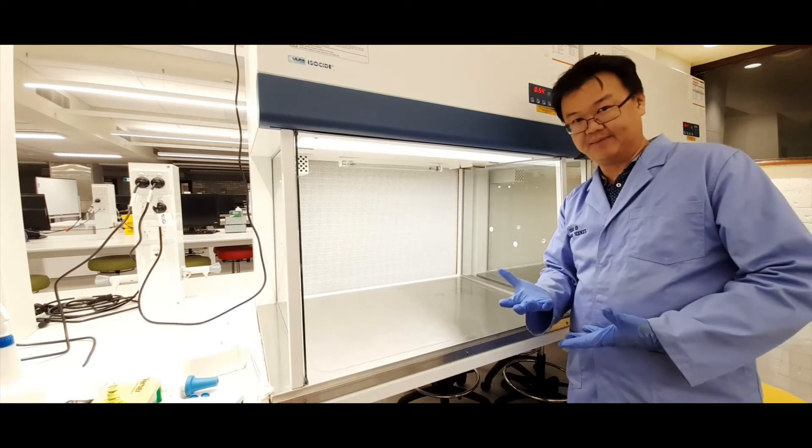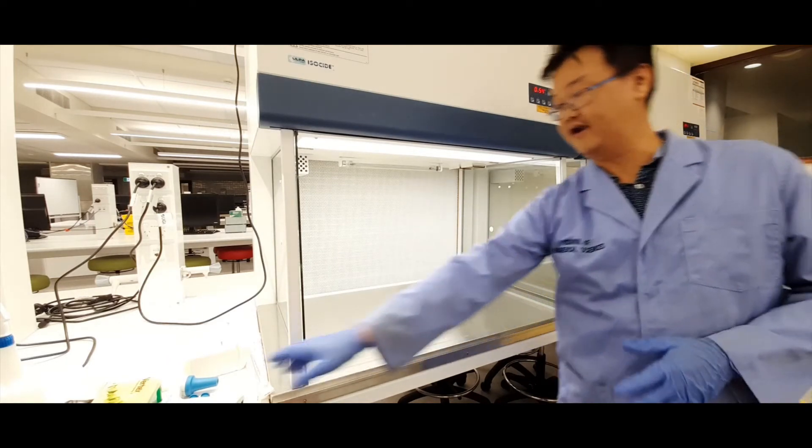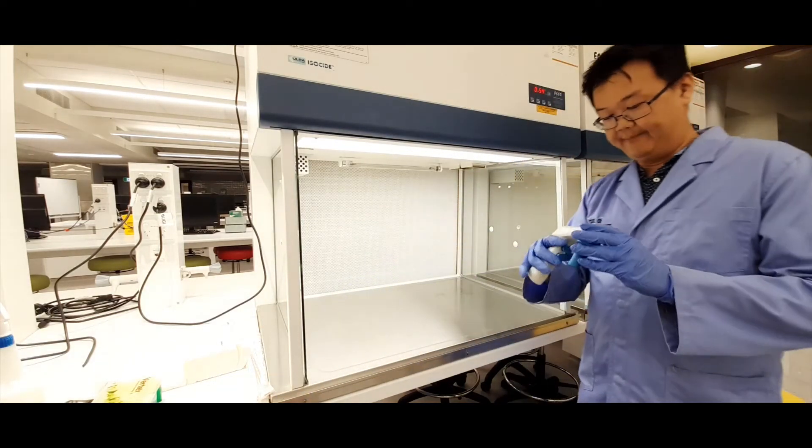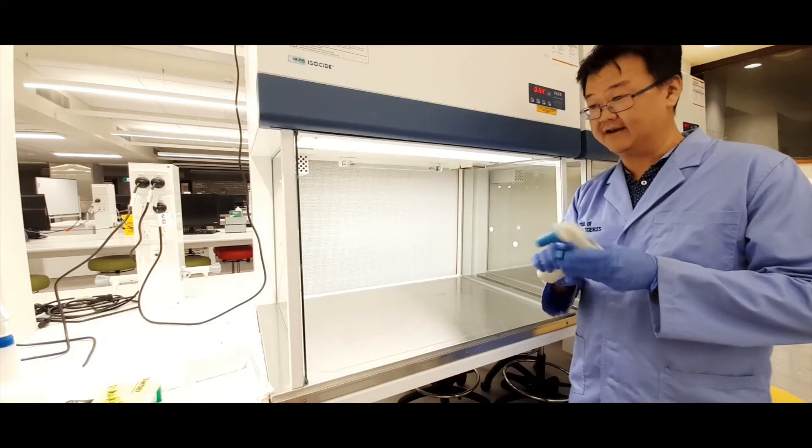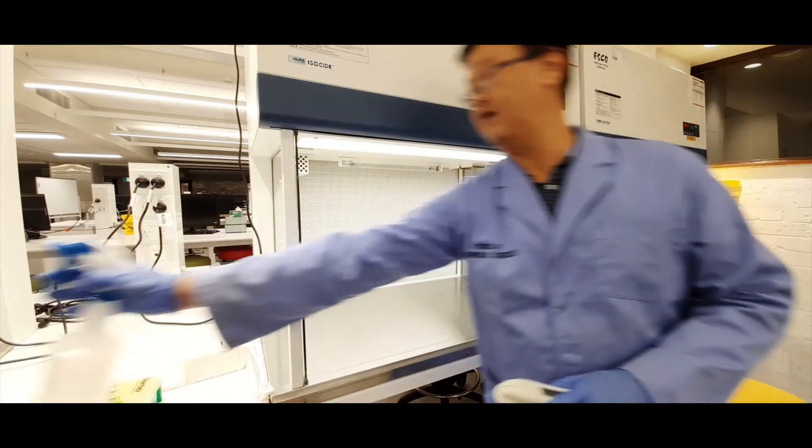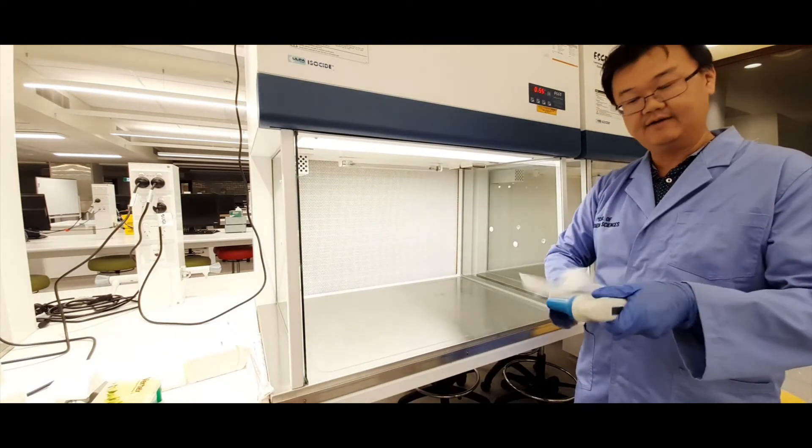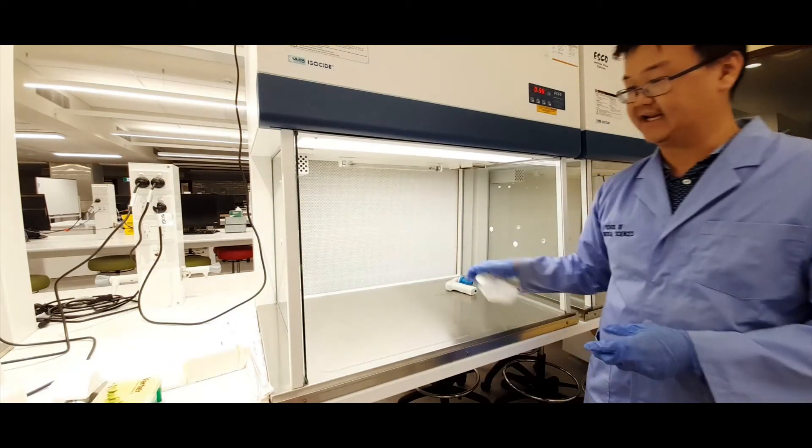So, for example, if I take this electronic pipette aid, or it's also called a pipette gun, just give that a quick spray with 70% ethanol and wipe that down with paper towels before placing that in the hood.